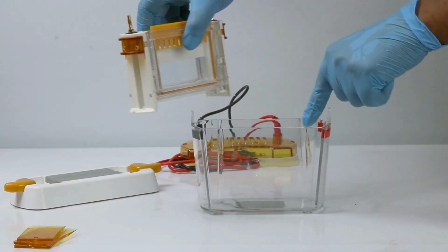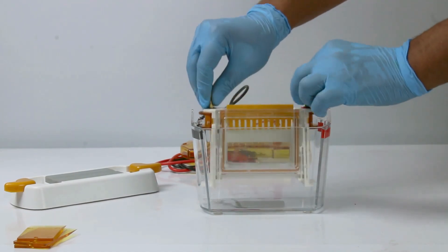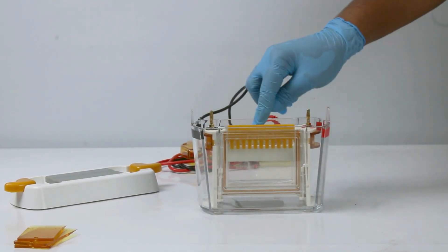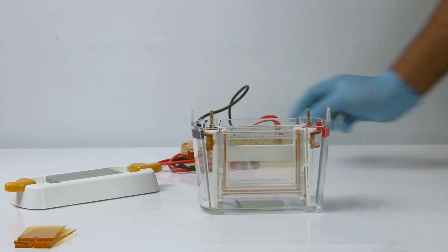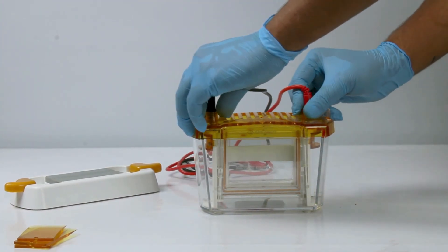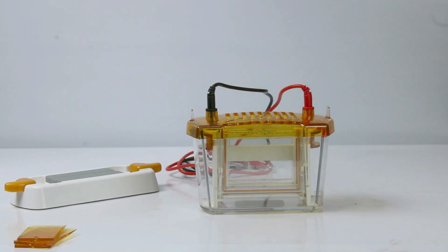Ensure the buffer level reaches the edge of the concave glass, at least 20mm deep. Carefully remove the comb and load the sample into the well. Close the tank and connect to the power supply to start electrophoresis.